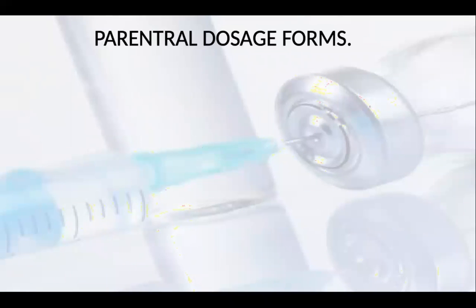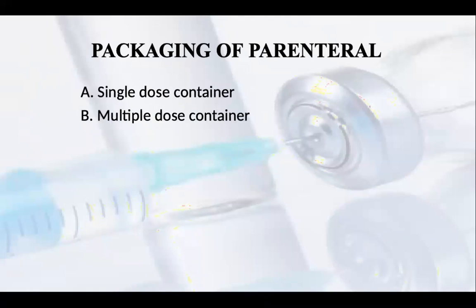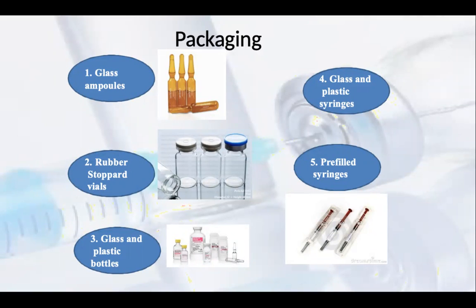So I can show you various dosage forms of parenterals. They are available in 2 types, single dose containers and multiple dose containers. Now you can have experience of various glass ampoules. Some vials have rubber stoppers. Some have glass, and plastic bottles are nowadays in the market. Glass and plastic syringes are available now. Fifth one is, nowadays you may have seen various vaccines in pre-filled syringes.